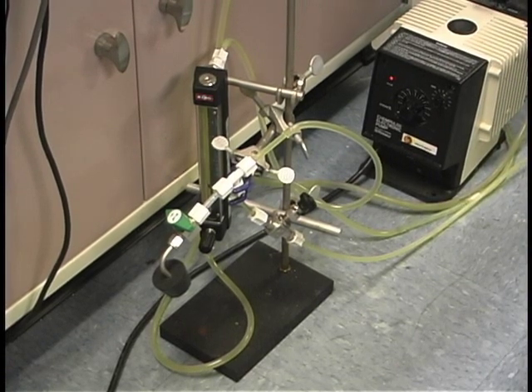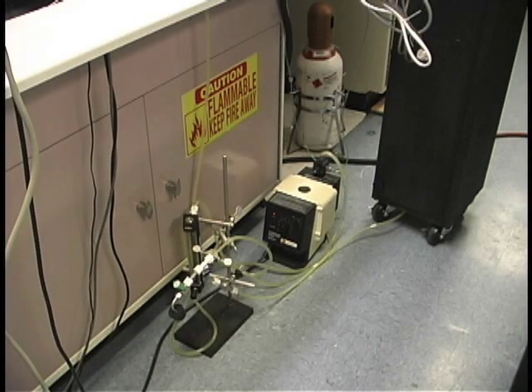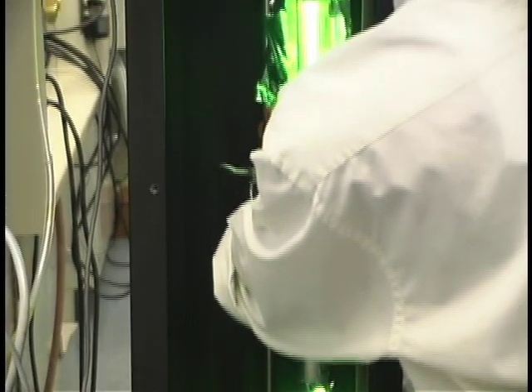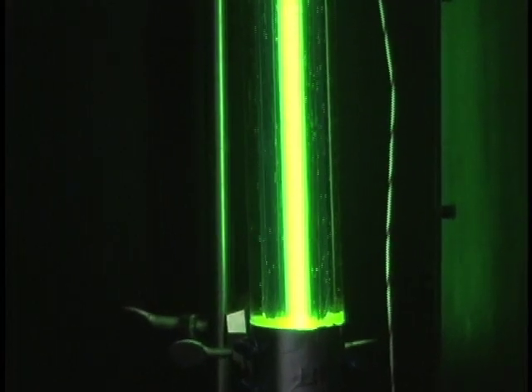Shown here is a flow meter and a pump that draws sulfide solution from the scrubber and sends it to the photoreactor. The UV photoreactor is housed in a 6-foot black box standing on the floor to the right. The photoreactor consists of a 30-inch, 60-watt low-pressure mercury lamp mounted along the center line of an annular quartz reaction chamber. This is a rare view of the photoreactor opened up while in operation. A steady flow of hydrogen gas bubbles can be seen rising to the top of the reactor.